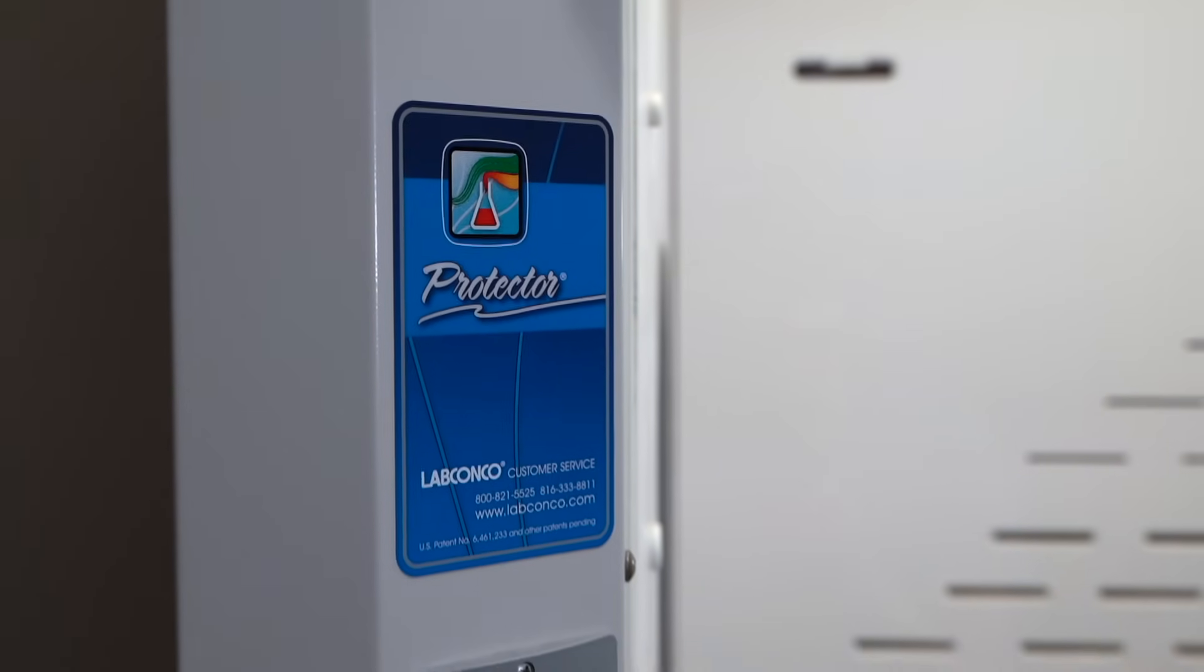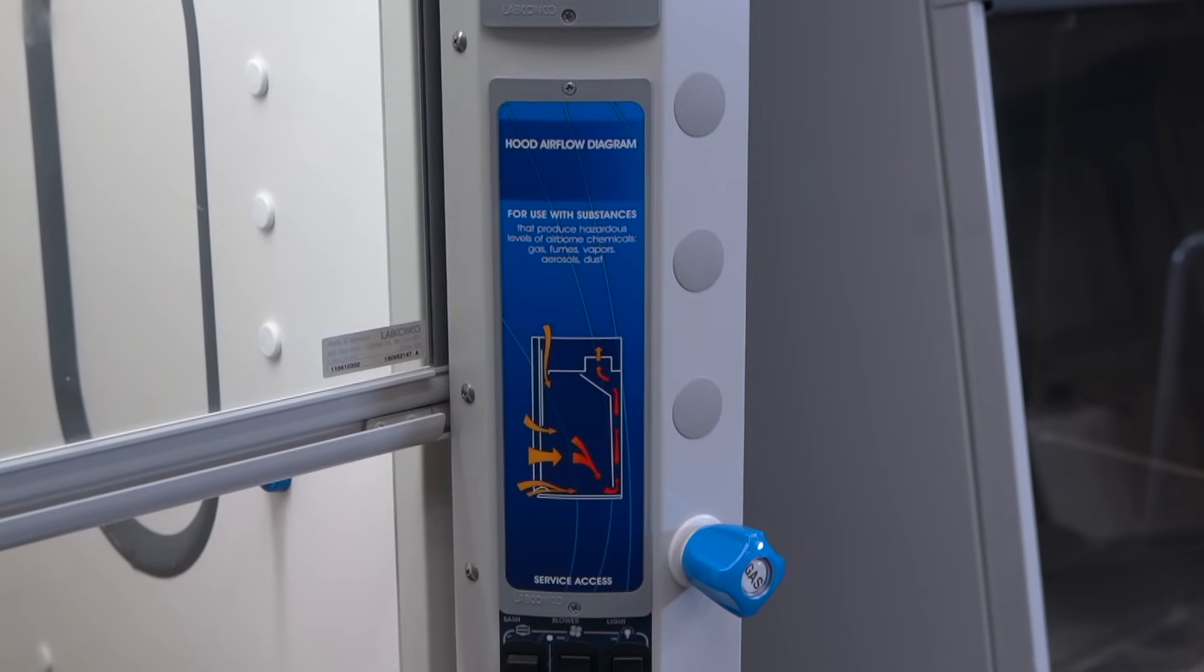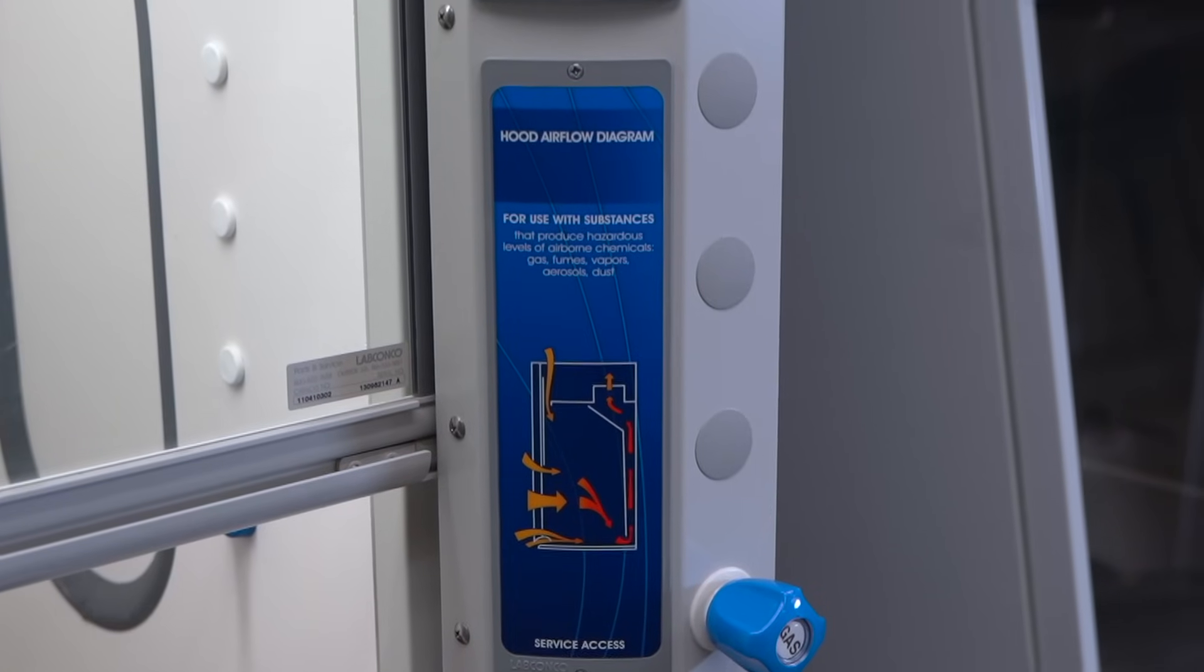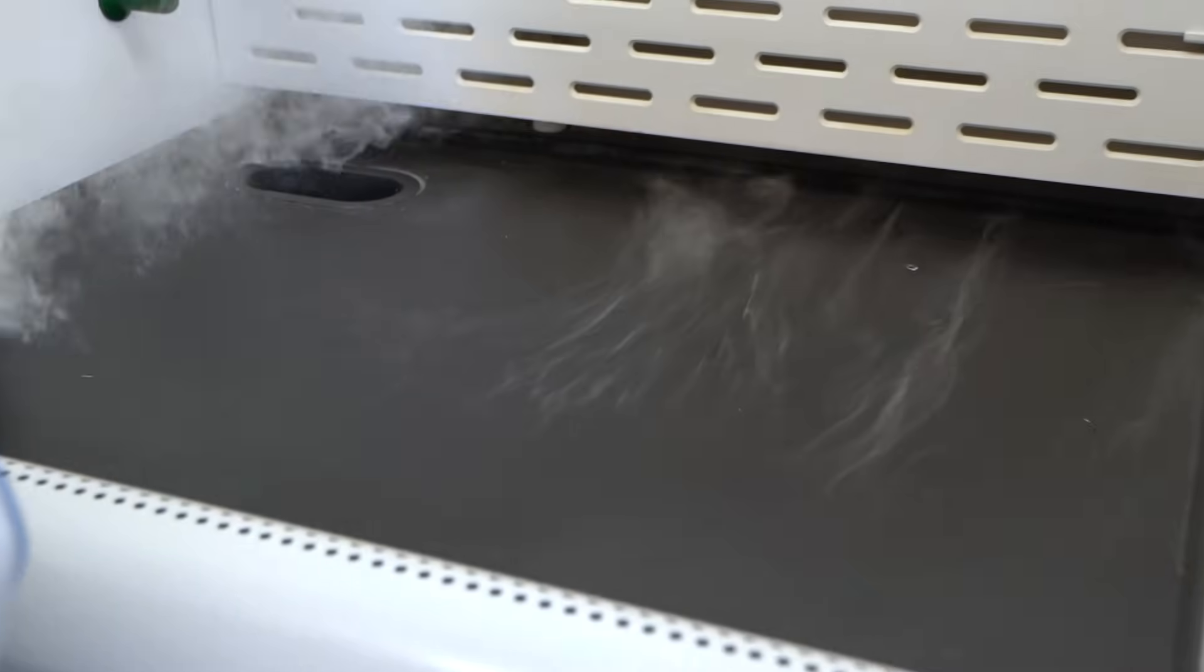Your fume hood is your laboratory's primary safety device for containing chemical fumes and vapors. Air flows into the hood to contain contaminants. Contaminated air is exhausted through a dedicated ventilation system.